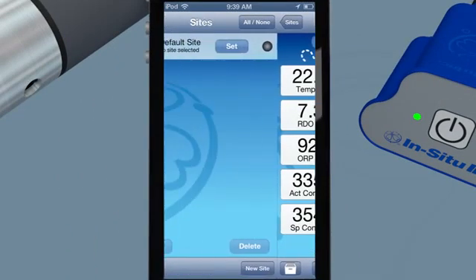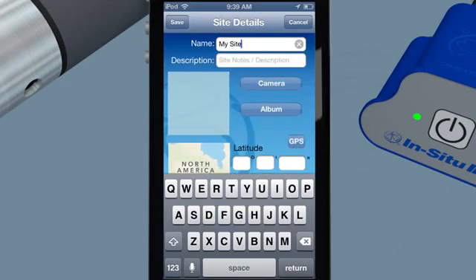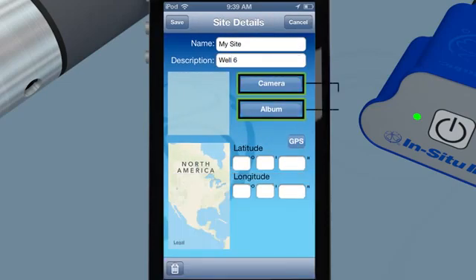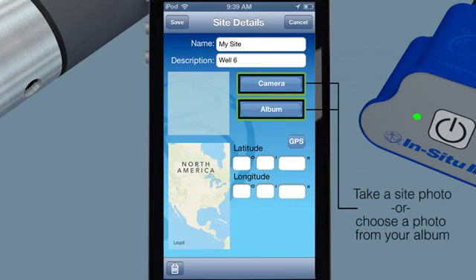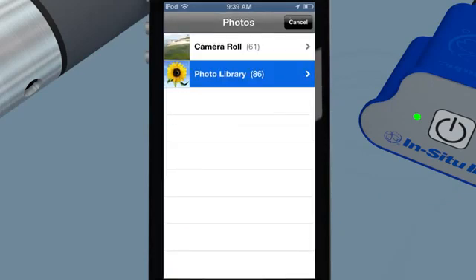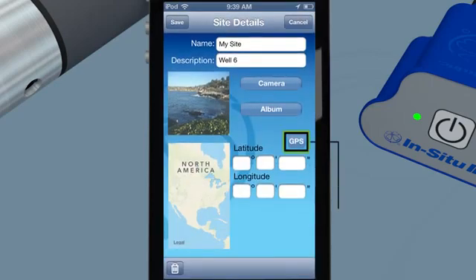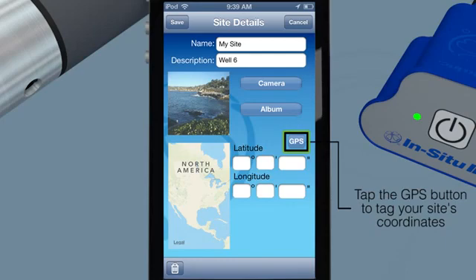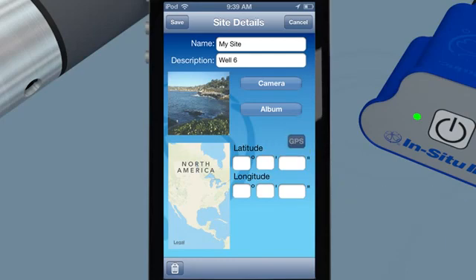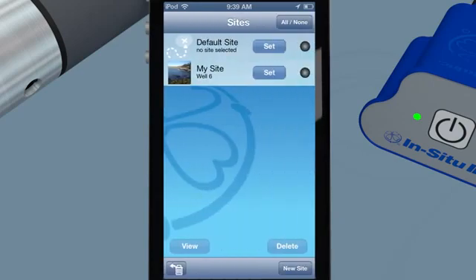Work from anywhere, anytime with wired or wireless connection. Coordinate your data and field notes into a single or multiple sites. Quickly find and recognize each of your sites by tagging them with a photo and GPS coordinates. Use coordinates and photos to identify exact measurement locations and facilitate volunteer monitoring efforts. Share data with other mobile devices on your iCloud account.